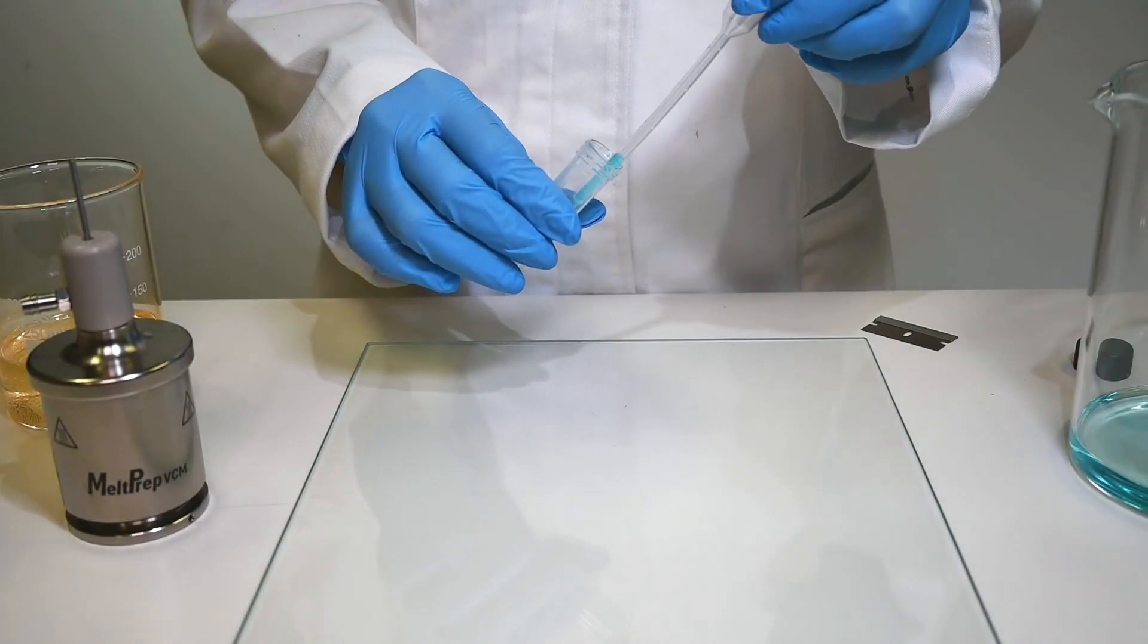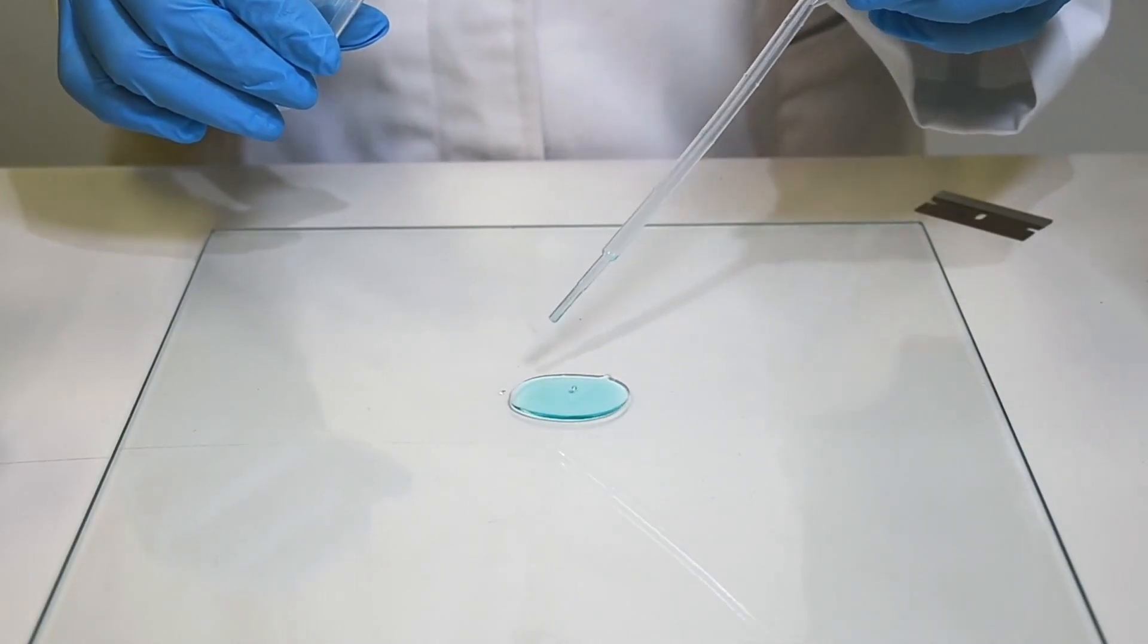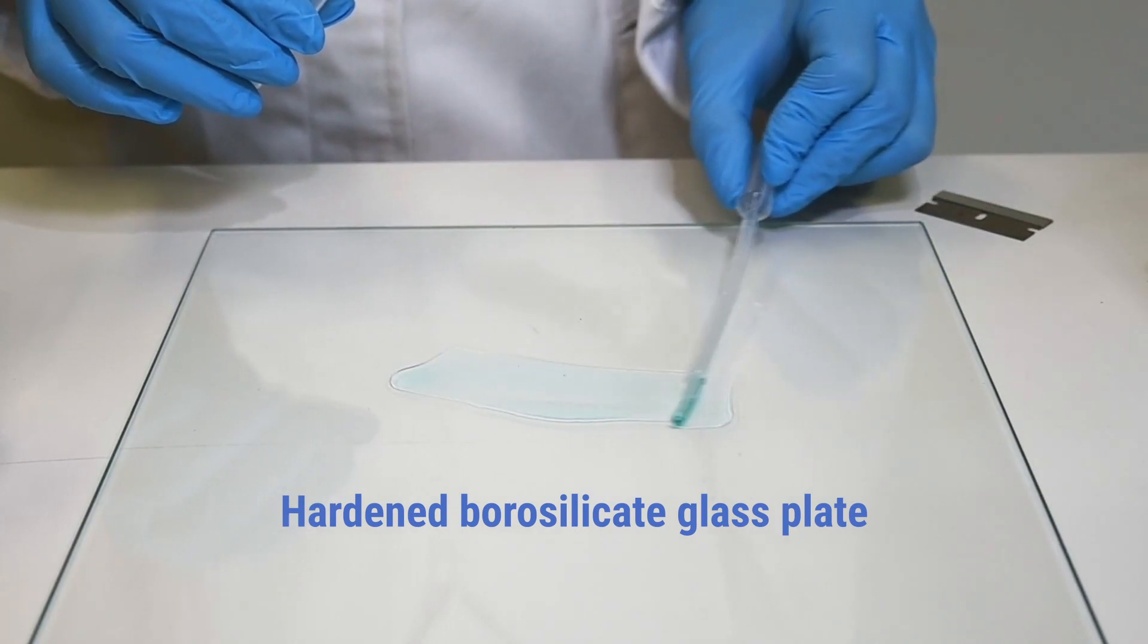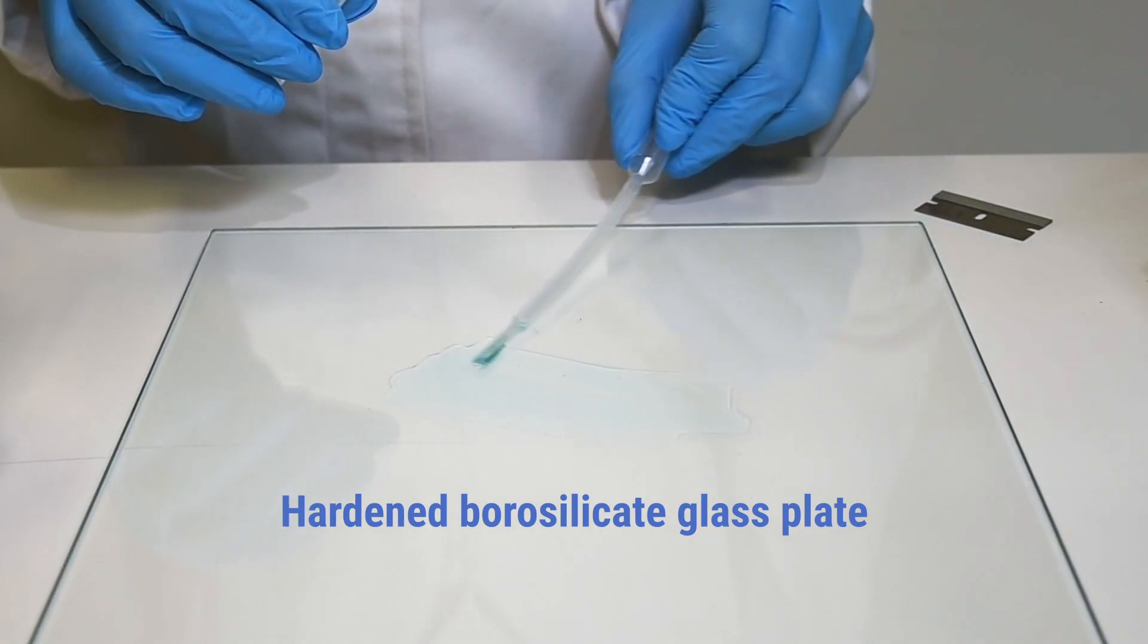Transfer the solution onto a flat glass plate and spread it into a thin layer. The thinner the layer, the faster the drying and the more uniform the resulting film.